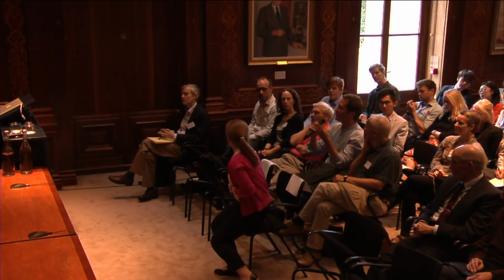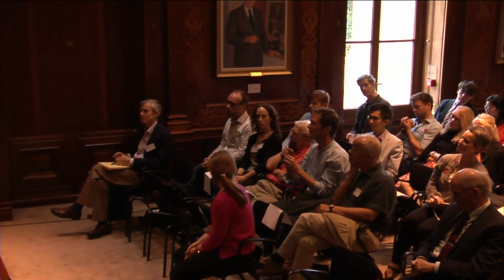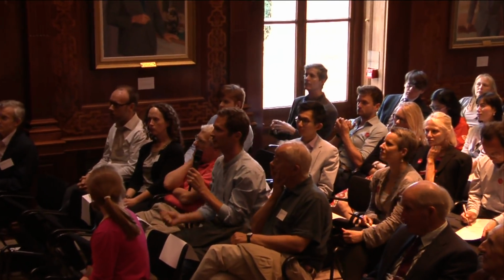Would it be possible, rather than using neuronal cell lines, would it be possible at some point to dissect a mouse brain and zoom in on what you want to see there and do tomography? Yeah. Well, I think the problem would start probably with vitrification. Tell me how to vitrify a mouse brain. When you go to C. elegans, you have to move from plunge freezing to high pressure freezing, and high pressure freezing is of course already a bit more difficult to combine with focused ion beam technology.